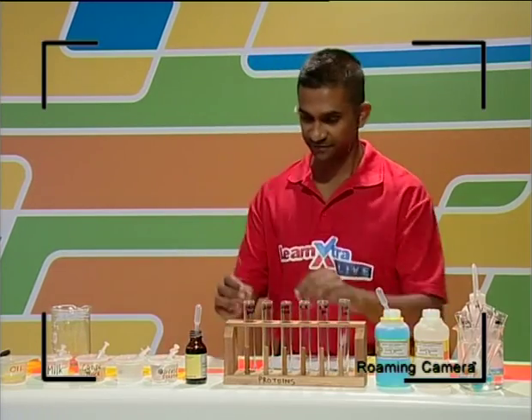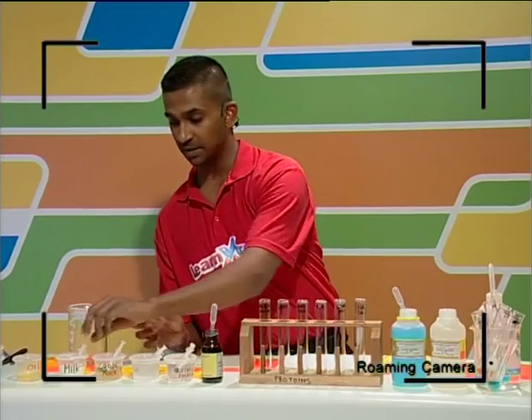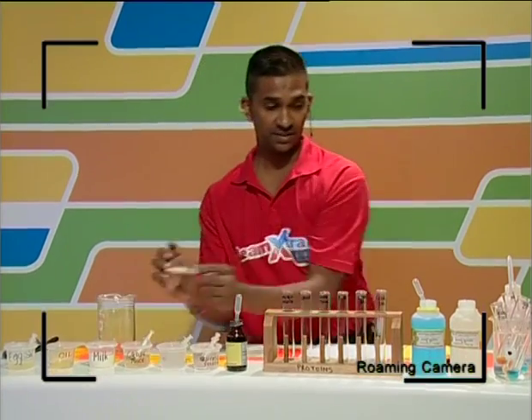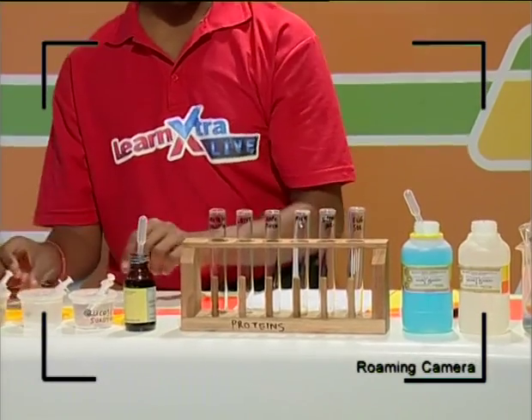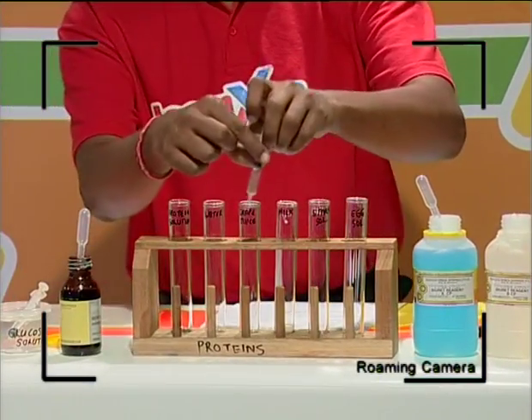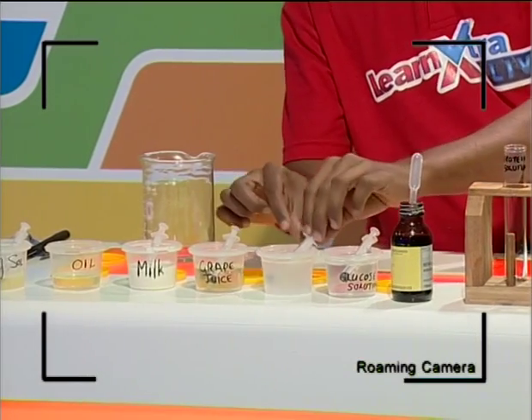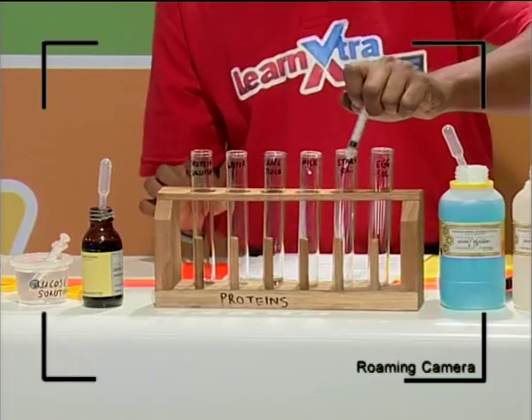So let's get busy. So the first one is a protein solution, and in that, I know, guys, that milk contains protein. So I've got milk here. I'm going to add milk into the test tube that says milk. I'm going to go on to grape juice, and let's try some grape juice into this test tube here. So we're putting in some grape juice in there. We're also going to try to see the presence of proteins in starch. So we've got starch. Put that in there.